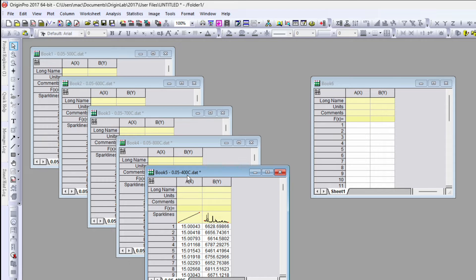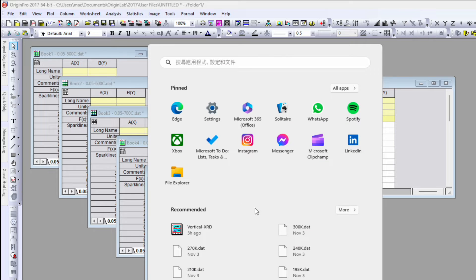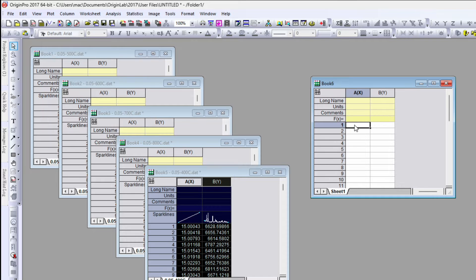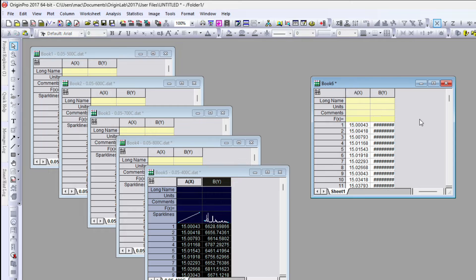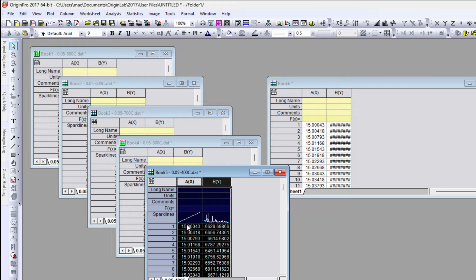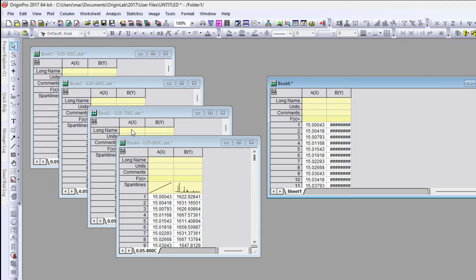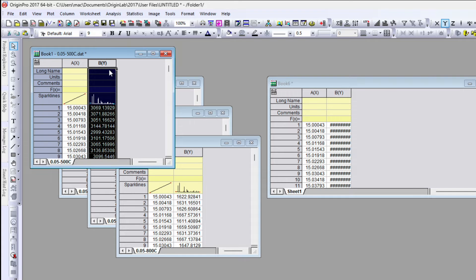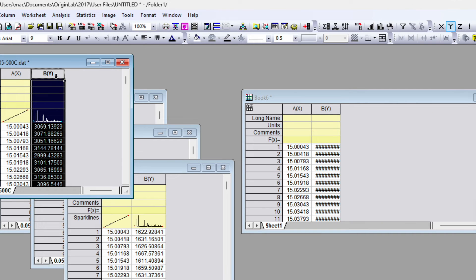The data starts from 400°C, 500°C, 600°C, 700°C, and 800°C. Select the row and column, copy it, and paste it into the new workbook. Before pasting, make sure the x-axis is the same for all data files — in this case it is, so go ahead. Now select the 500°C file.